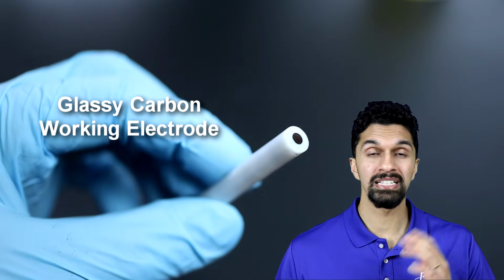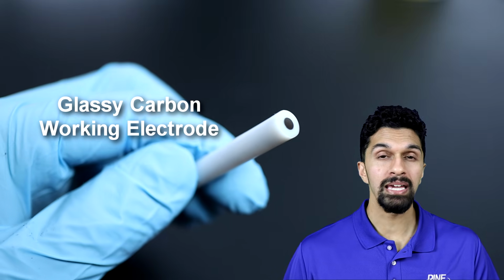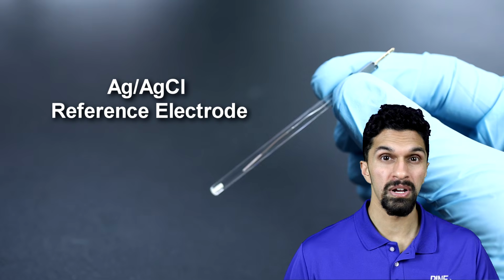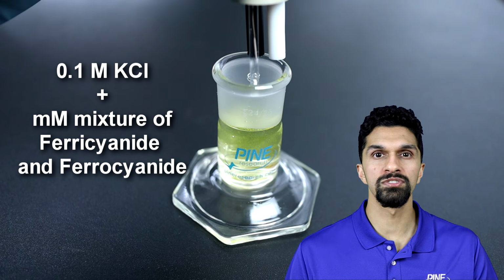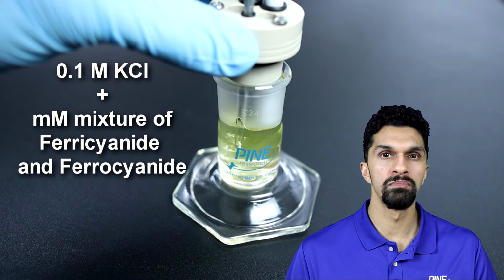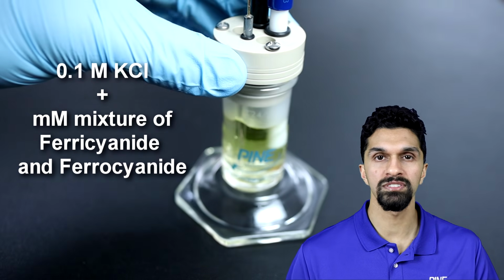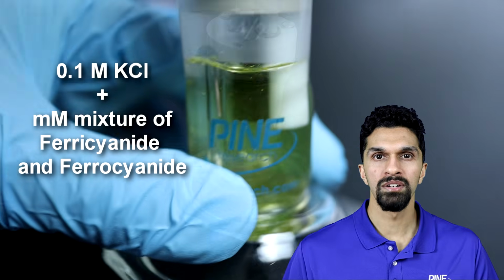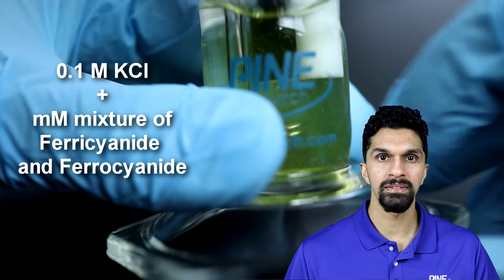Let's take a deeper look at what the open circuit potential is and what we mean when we say the difference between the working and reference electrode potential. First, let's describe the electrochemical system. I have a 3-electrode system, so I have a glassy carbon working electrode, a platinum wire counter electrode, and a silver-silver chloride reference electrode. All 3 electrodes are immersed in a 0.1 molar potassium chloride electrolyte solution that contains a millimolar mixture of ferri and ferrocyanide.